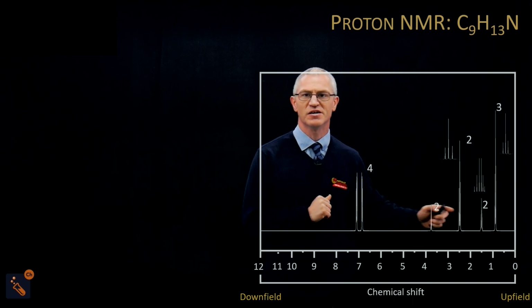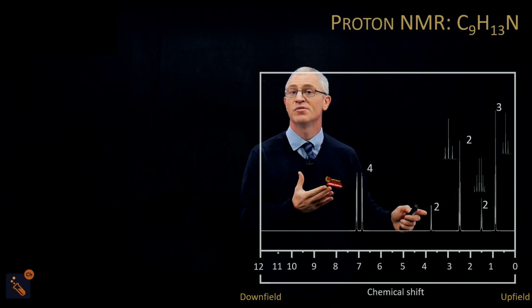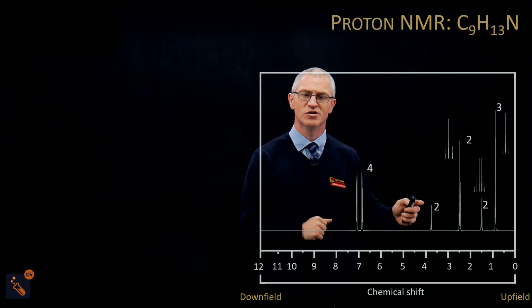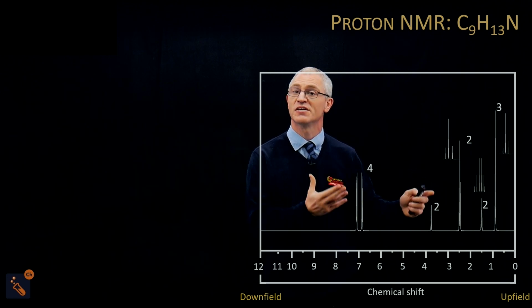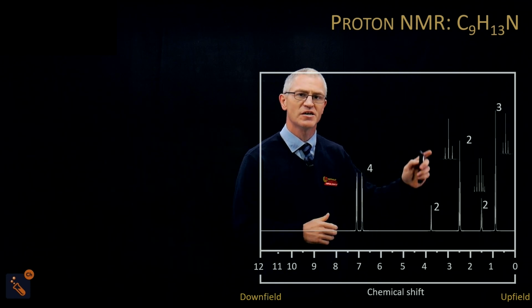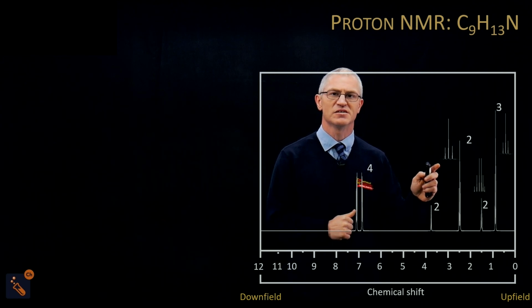They can again go anywhere from here to here. They can have 1 by them, but if it's NH2, they'll have 2 by them. And you can tell the difference, for example, if there's an O or an N. So if you see a peak that looks like an alcohol and there's an N there and not an O, you know it's an amine. So we think we've got an NH2, and we've got a disubstituted benzene here.